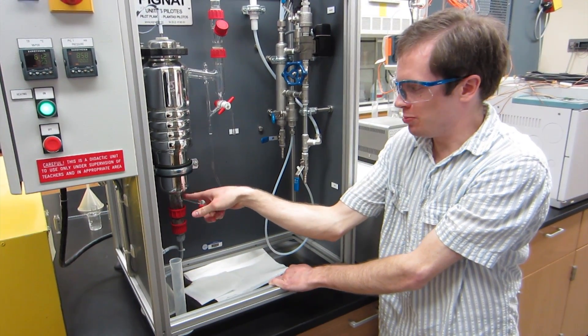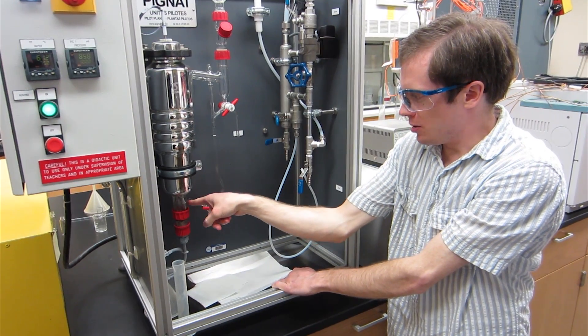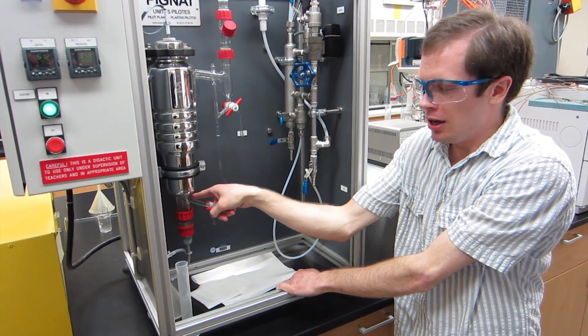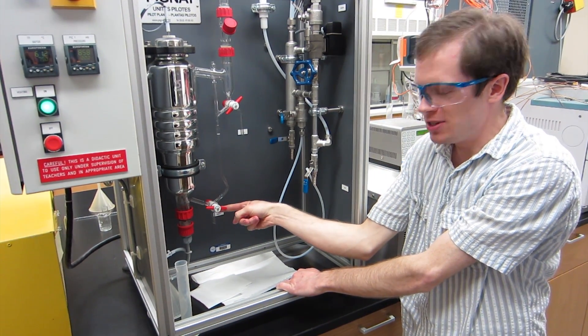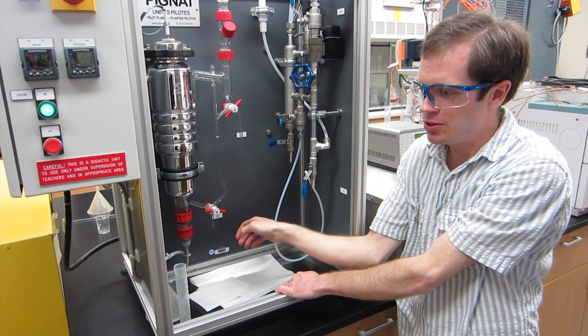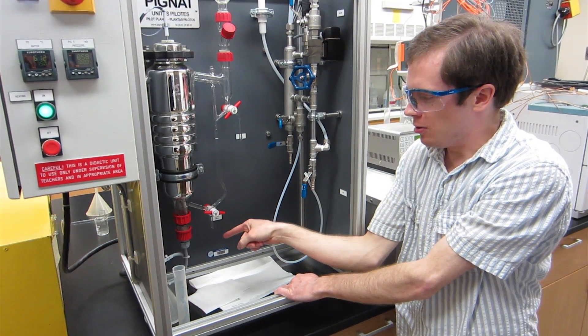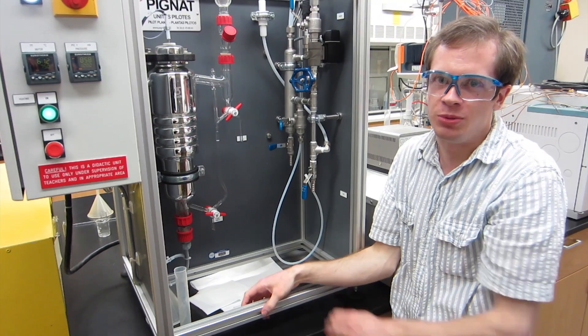So what we do is we first open this valve this way so it only drains from here and we purge it about 15 to 20 milliliters into a waste receptacle and then only then do we take our liquid sample.